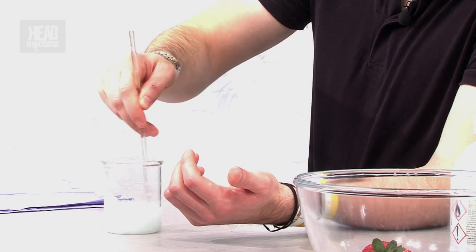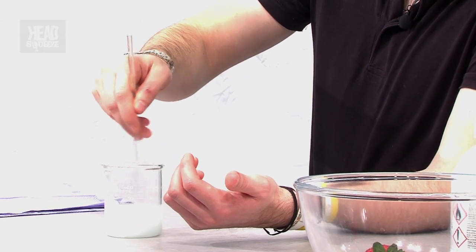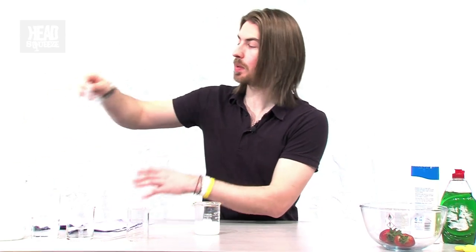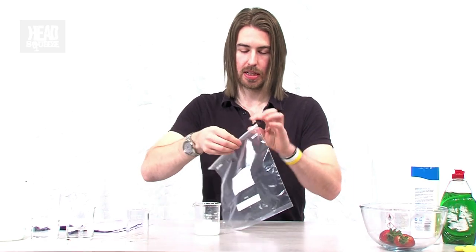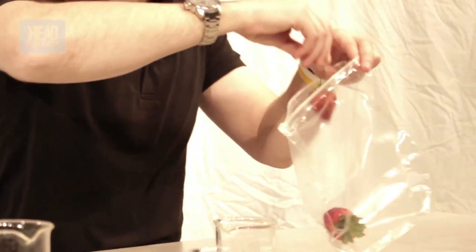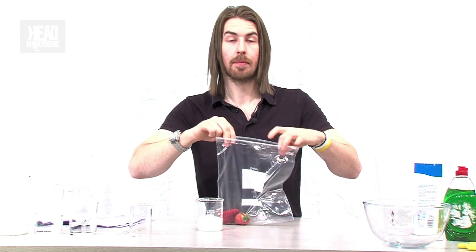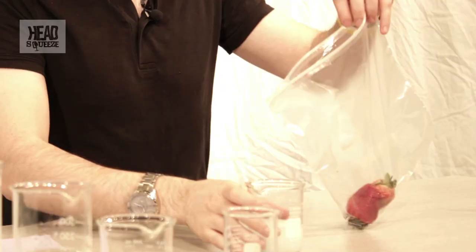Once you've made your extraction solution, it's going to go in a bag with the strawberry as well. Get a normal ziplock bag — something that's not going to explode when you start mashing the strawberries, which has happened to me before. Put two or three strawberries in. It's a good idea to freeze them beforehand to make them more mashable, or leave them out of the fridge for a couple of days so they're a bit more tender.